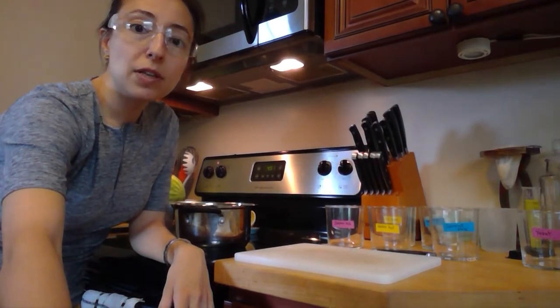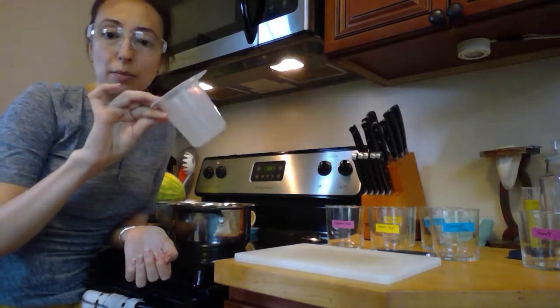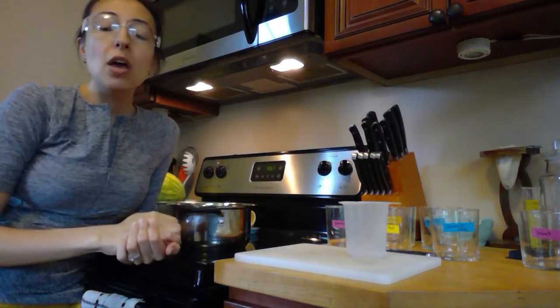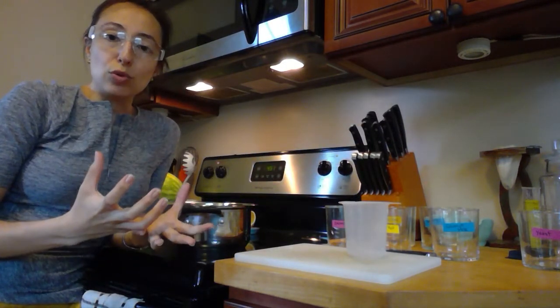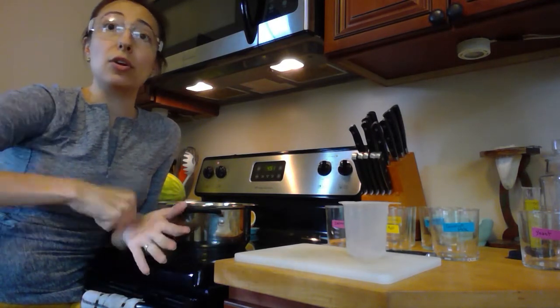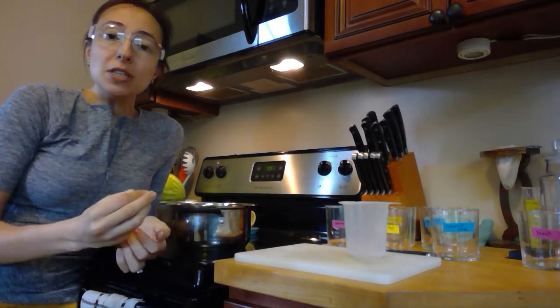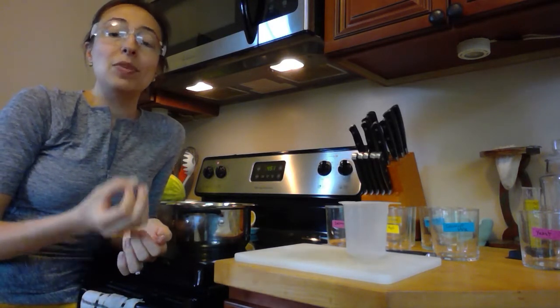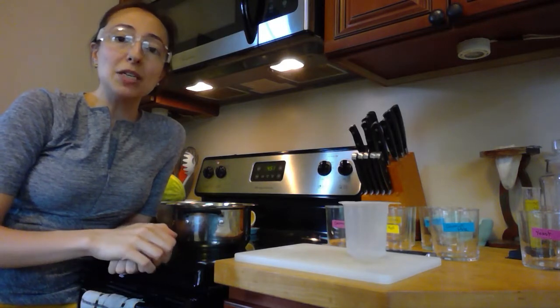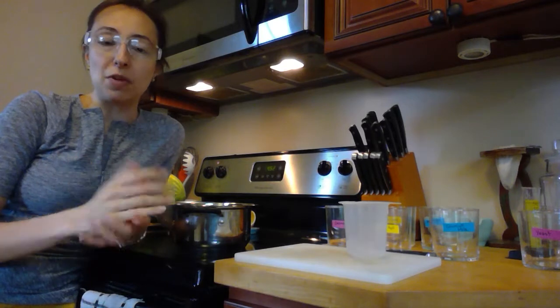It says you're going to fill up the container with 200 milliliters of substance, so that's where your beaker comes in, that came with your lab kit. Now, whatever substance you use, if it's not a powder, you can grind it up, like if you use an antacid tablet. If it's in some kind of solid form, get it to a powder, and then you're going to have to mix it with neutral water, right? Just some regular tap water should be fine.